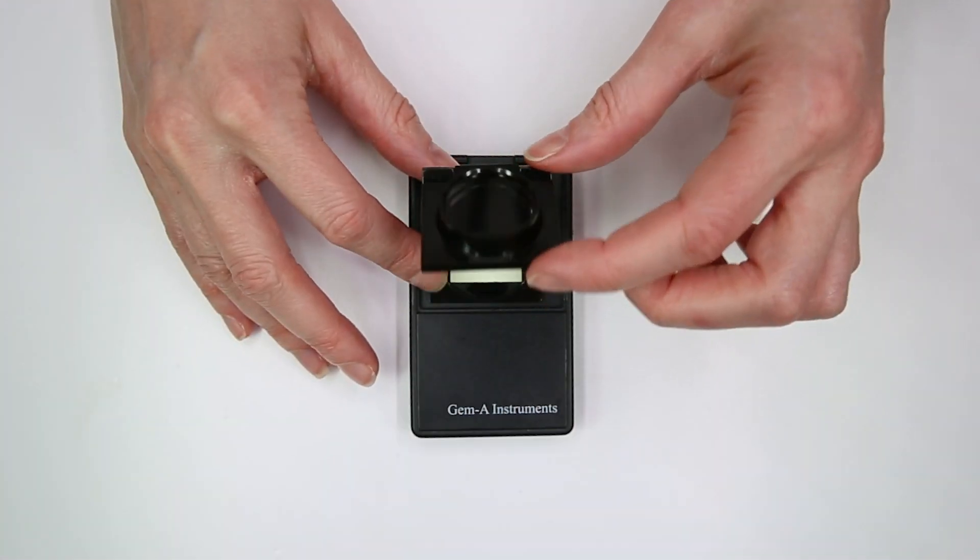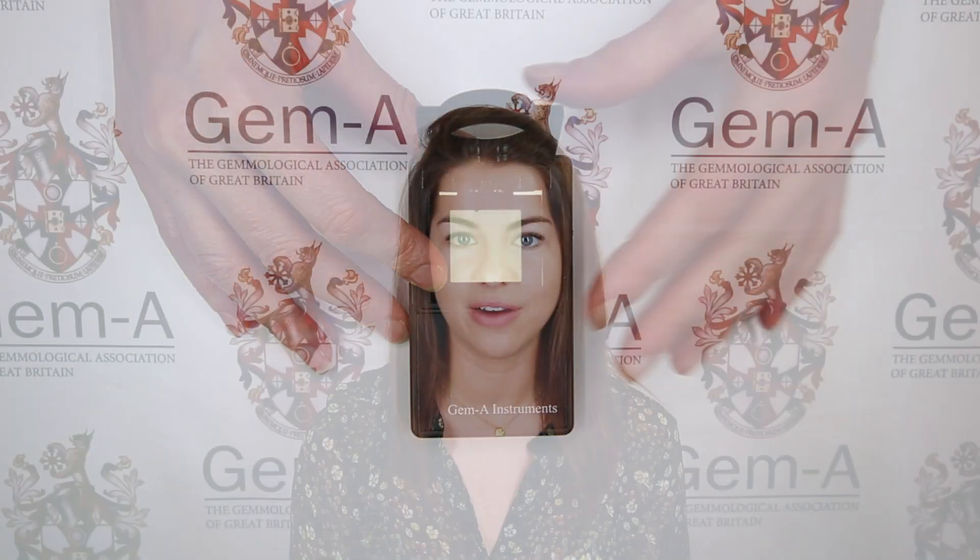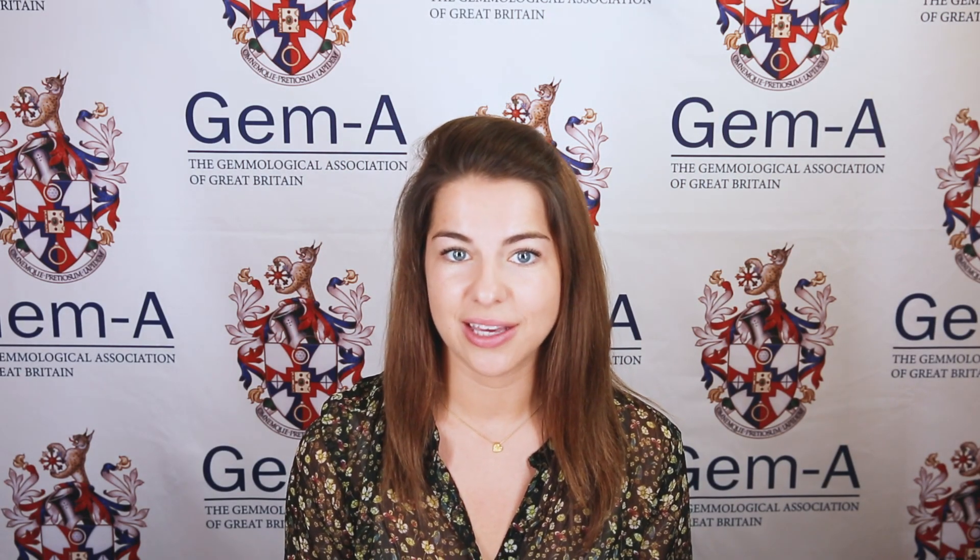Another factor that can affect results is a dark rim seen when the gem is in its light position. This dark rim is seen when the angle of the crown facets reflects away the light from the polariscope, making these areas look dark, but this might still be the gem going completely light. To check whether this is the case, remove the top filter of the portable polariscope. What you see here is what the gemstone will look like from its lightest position if it has one. If the dark areas are still present when the top filter is removed, they can then be ignored when put under the polarising filter.